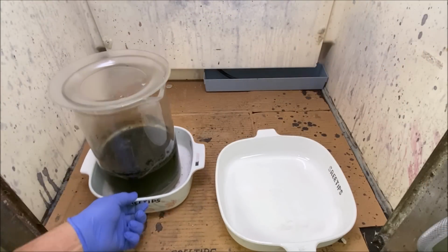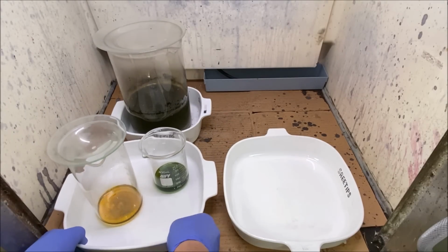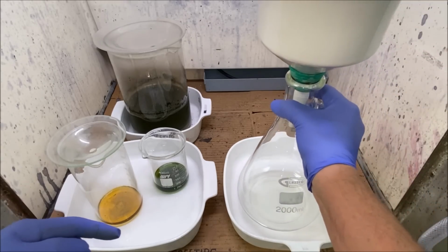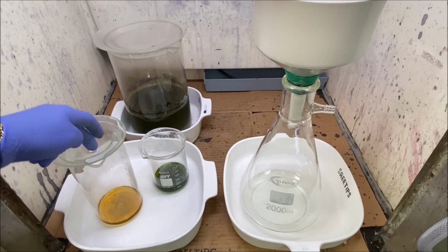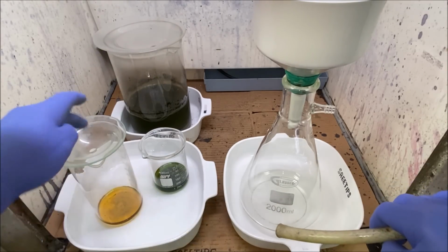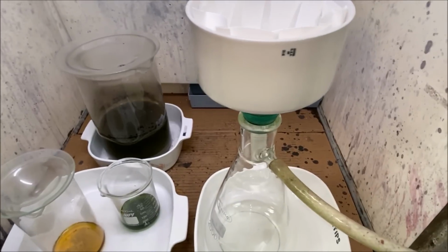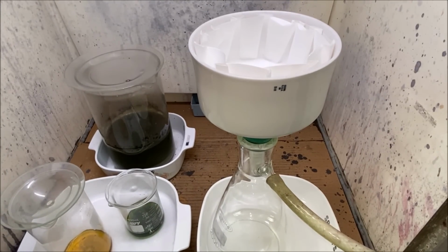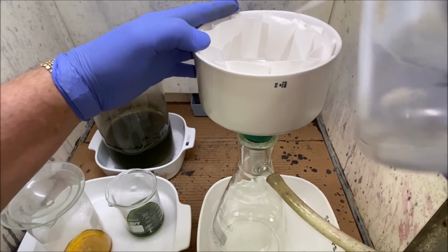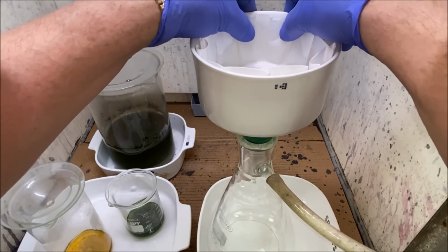In the comment section for part 4, someone asked why I didn't add sulfuric acid to these beakers to precipitate out lead. I did add it to this one. I didn't add it to this one or this one. The reason I added it to this one is out of force of habit, but we're still in the recovery process here. We're not refining yet. We're trying to recover the values out of this material still. Recovery and refining are two different processes completely, and we're still in the recovery process.